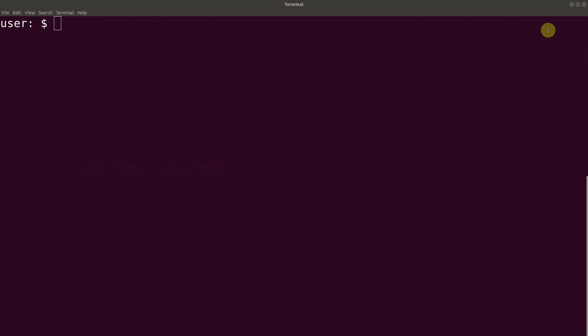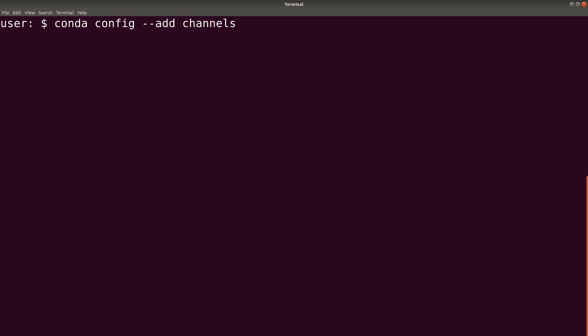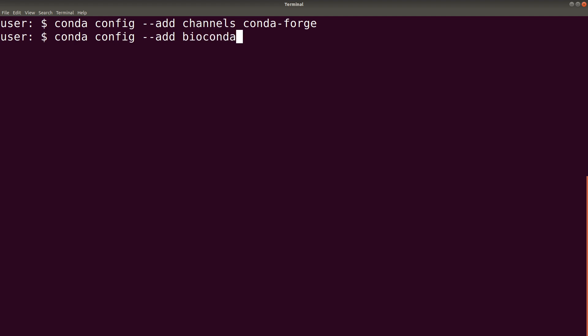You will add two channels. So first one is the CondaForge. So we say conda config --add channels CondaForge. The next channel is the BioConda. So we say conda config --add channels BioConda.